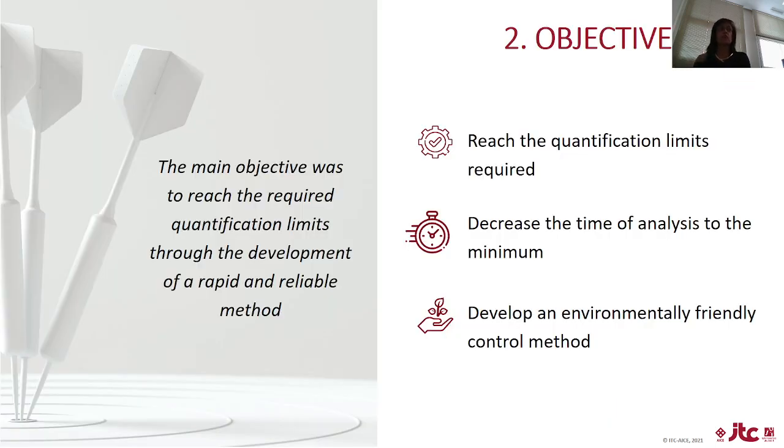So, the aim of this study is the development of a measurement methodology by ICP-OES in order to reach the quantification limits required in the food regulation for these materials with a minimum time, so the method could be used as a control method, and so that the new methodology is environmentally friendly.